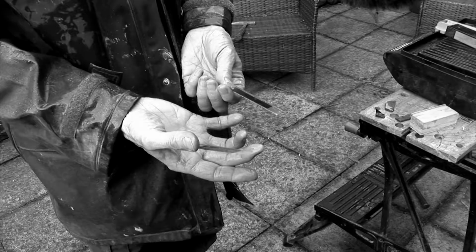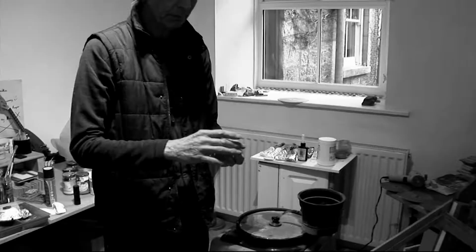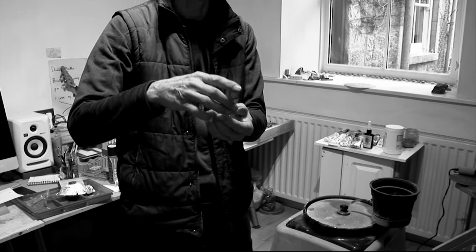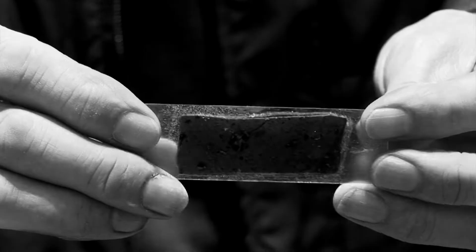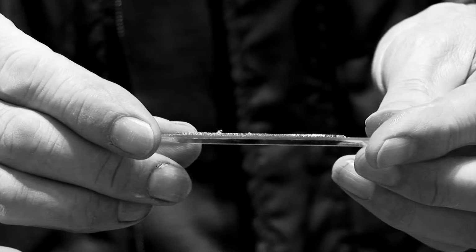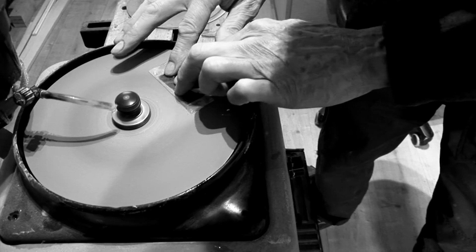Yeah, that's going to be fine. It's going to work. What we want to do is shine light through it on the microscope. And you can look down and you can see all the minerals inside. But if you shine light against that, it just wouldn't go through. It's too thick. So back to the lap wheel and start thinning it down. And then we'll finish off doing it by hand.